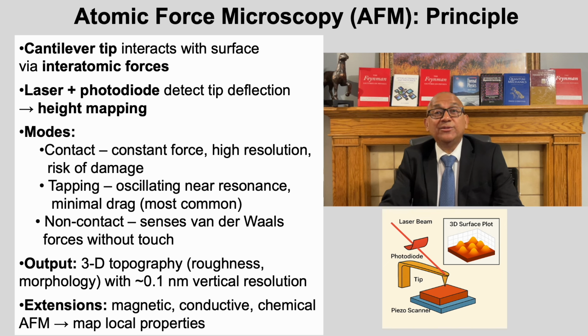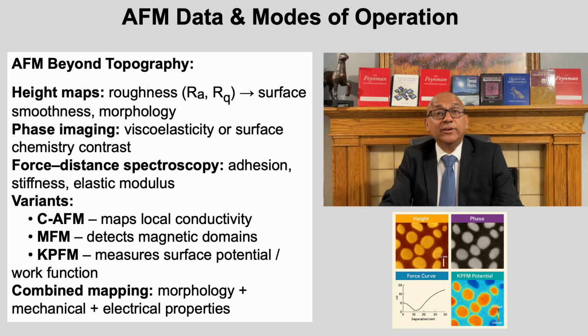Specialized probes extend its capability, allowing magnetic, electrical, or chemical mapping, making AFM a versatile platform for surface and functional characterization. Atomic force microscopy goes far beyond simply generating height maps.